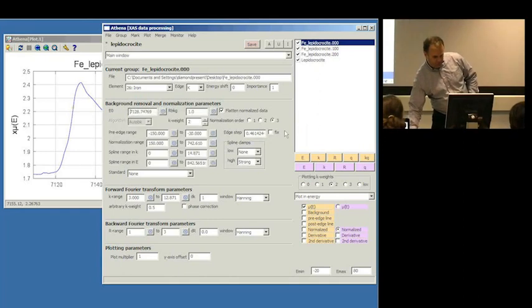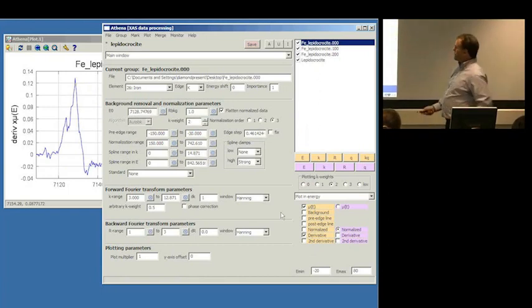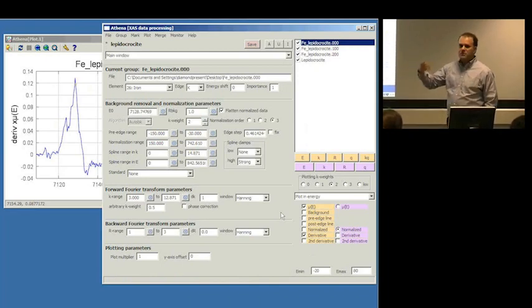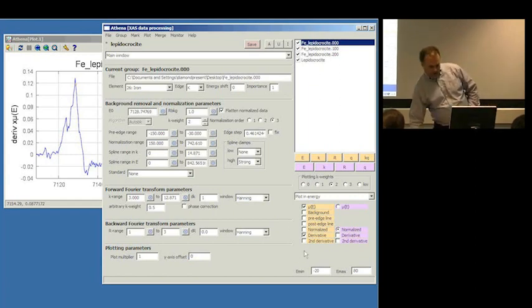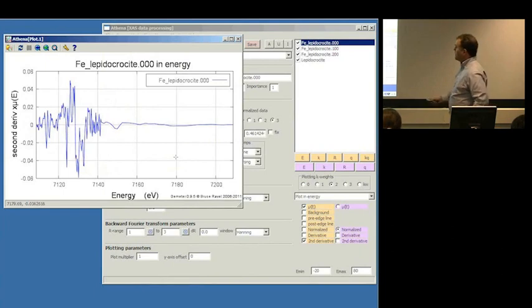When you select that one, it first does either using the current value, if there is one, or if you're just importing the data for the first time and you wanted to choose this zero crossing of the second derivative as its default value, it needs to come up with a first guess, which will be this value. It will then look at the second derivative spectrum, which is pretty noisy here, and it will look for the nearest zero crossing. So the point it would find would be that point right there, just a little bit lower in energy, which actually is the peak of the first derivative.